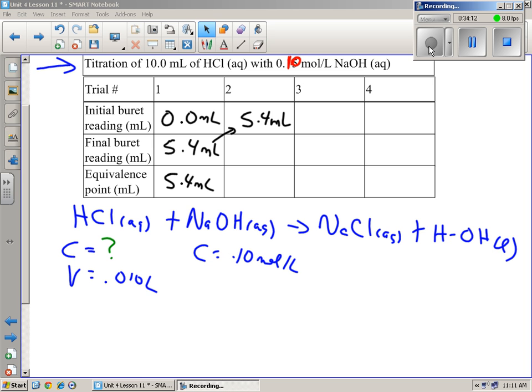The other thing you don't want to do is you don't want to put it on the side. So don't take the flask and kind of put it on the side, because it's not going down into the solution. Okay. So if at all, well, don't do that. Okay.